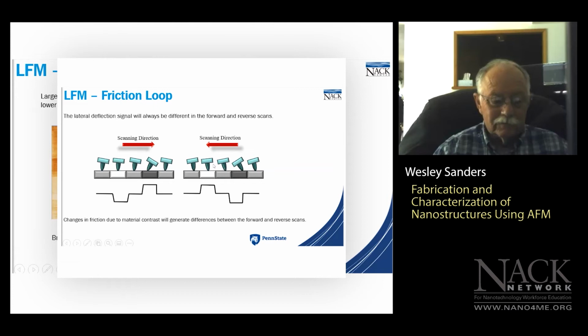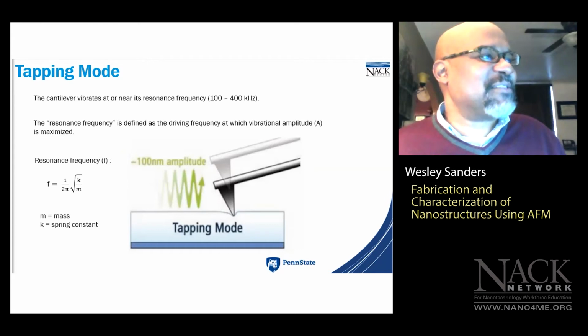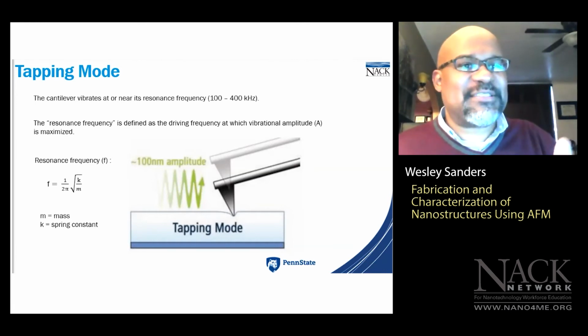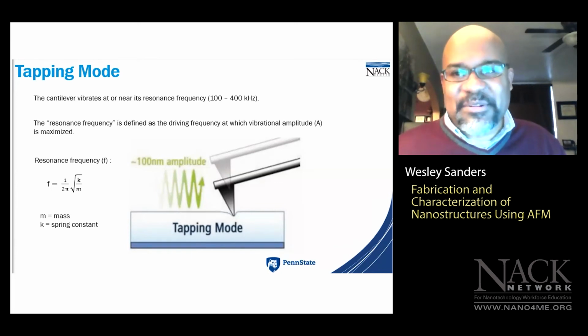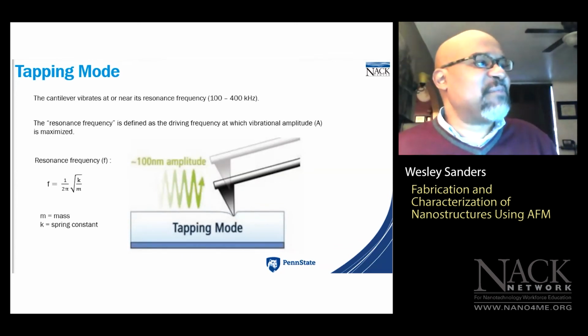Okay. All right, any other questions about LFM or frictional force microscopy? No? All right, so the last technique we'll talk about before Glen gets his demo is phase imaging. I'm going to skip over a lot of this just so we can get to Glen's demo and give y'all an opportunity for remote access to control the microscope remotely if that's something you want to do.